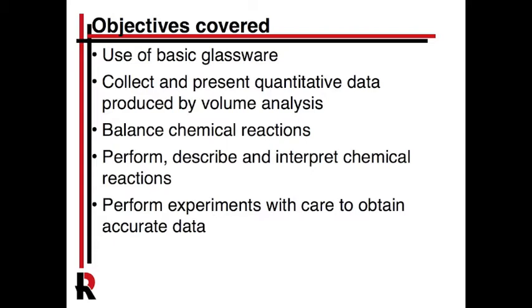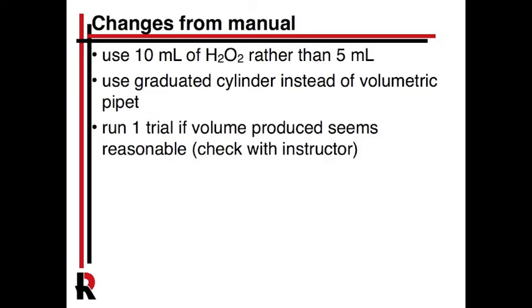And I think if you do this experiment carefully, you can get really good data and really manipulate the gas law and see how all these components are used with the gas law in a more real-world application. Now, of all the labs, this lab has the most changes compared to the manual, because we have a different collection device for the gas. So there's actually a separate set of instructions and protocols.